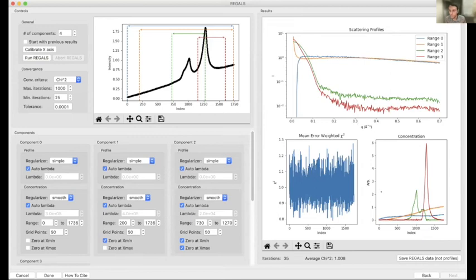So you can see it's minimized the chi-squared really well. In the lower right are what those concentration profiles look like. So blue and orange are the ones describing the buffer. Green and red are describing the protein. And it's interesting, you can see that the actual protein elution peaks are very bizarre looking. And that's partly because this anion exchange chromatography is not quite what we're used to looking at with SEC.